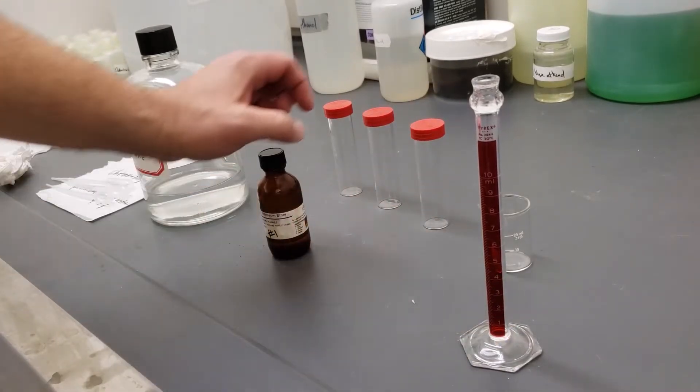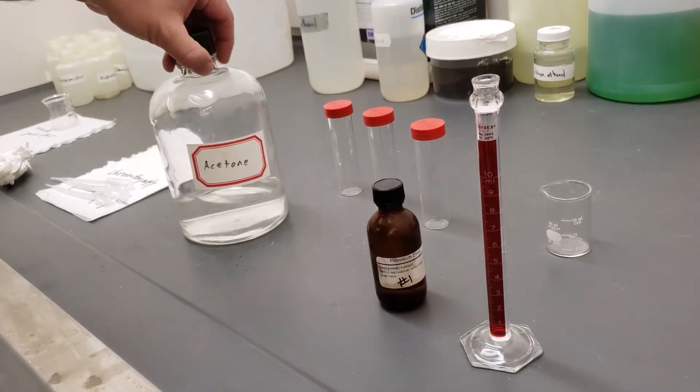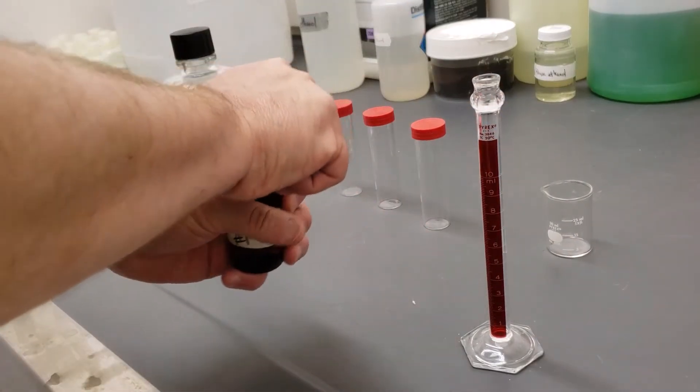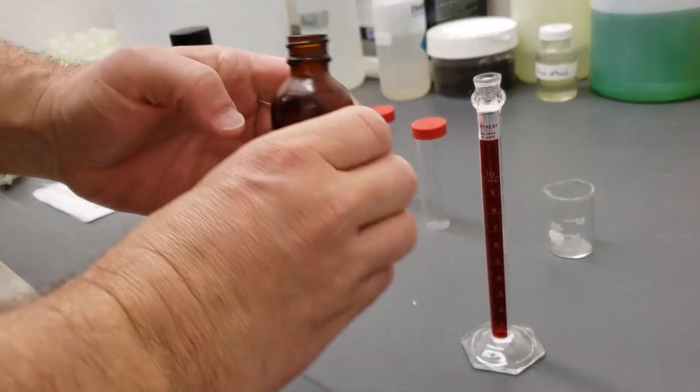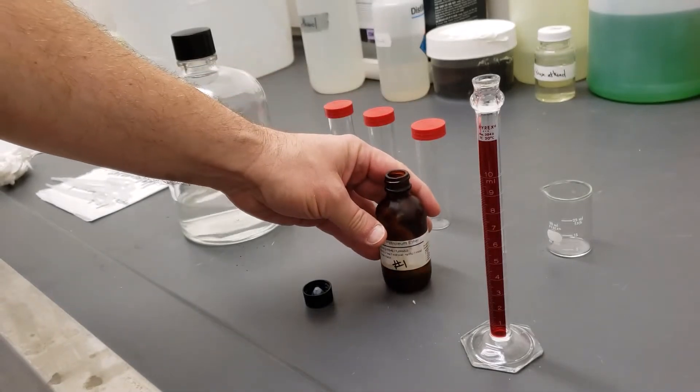So I have my graduated cylinder here, my petroleum ether and my acetone. I want to mix a nine to one mixture of petroleum ether with acetone.